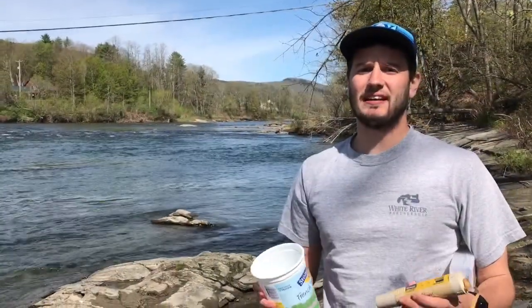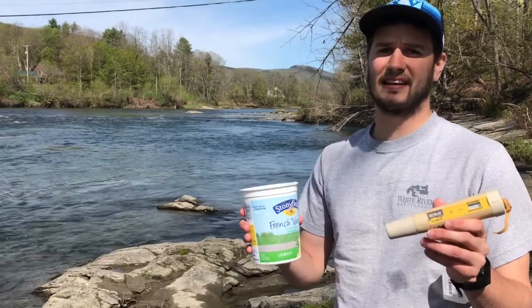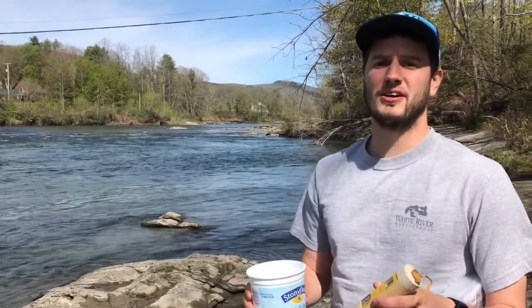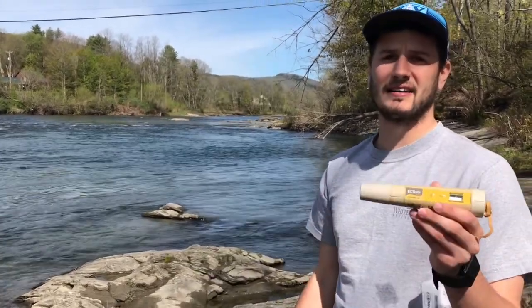Hi everyone, my name is Christian and today I'm going to show you how to take your conductivity testing on your water quality monitoring days. When you get down to the water you need to make sure you have all the equipment you need, which is a yogurt container and your conductivity pen.